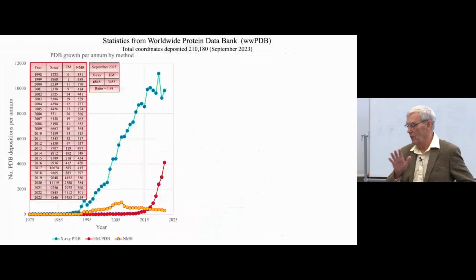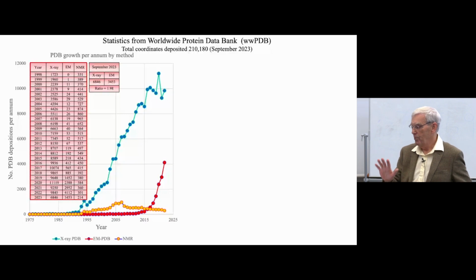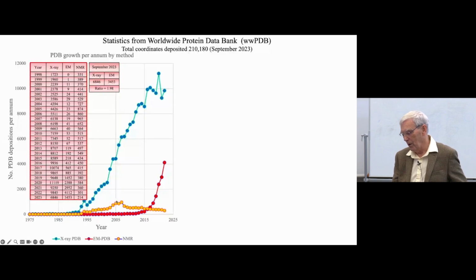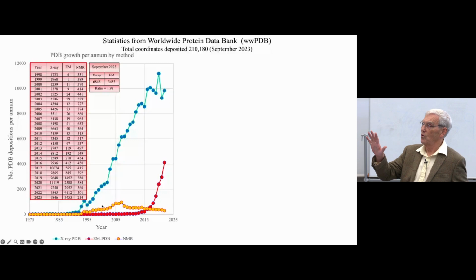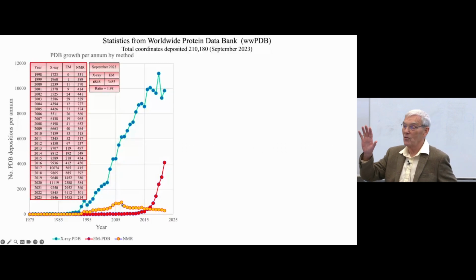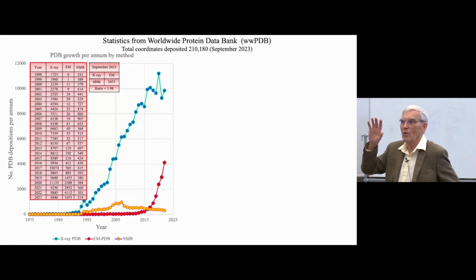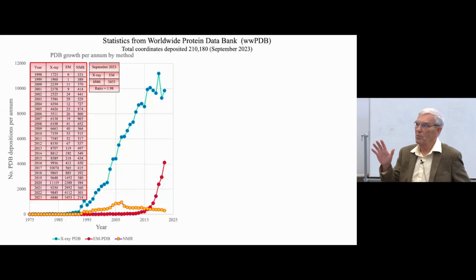And then if we look at what's been done since 2014, the last 10 years now, these are the Protein Data Bank deposits of atomic models of structures done by the 3 different methods: NMR, X-ray crystallography, and cryo-EM. You can see that NMR was quite popular, say, 20 years ago for small structures that you couldn't crystallize. It rose at about a quarter of the rate of X-ray crystallography and peaked in 2007. Now NMR is still very powerful, but it's used for weak ligand binding, kinetics, or mobility and so on. No longer so much for de novo structure determination.